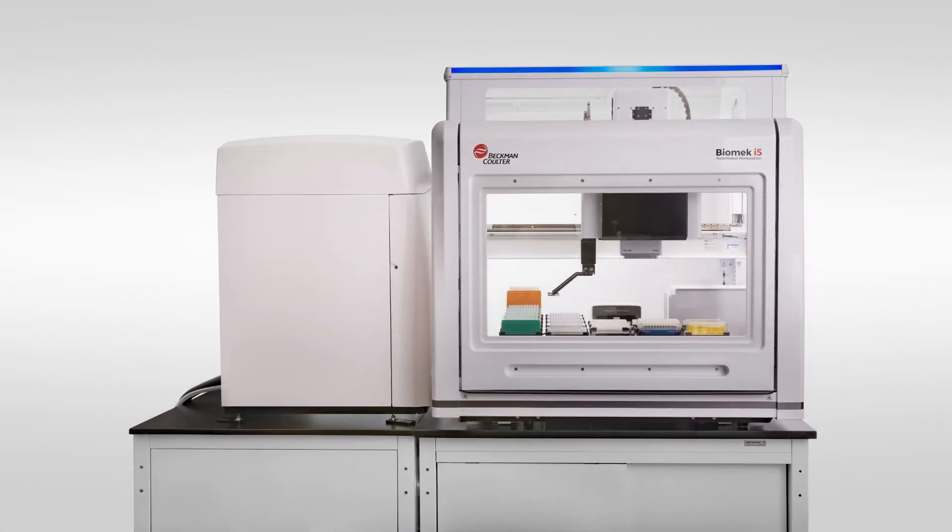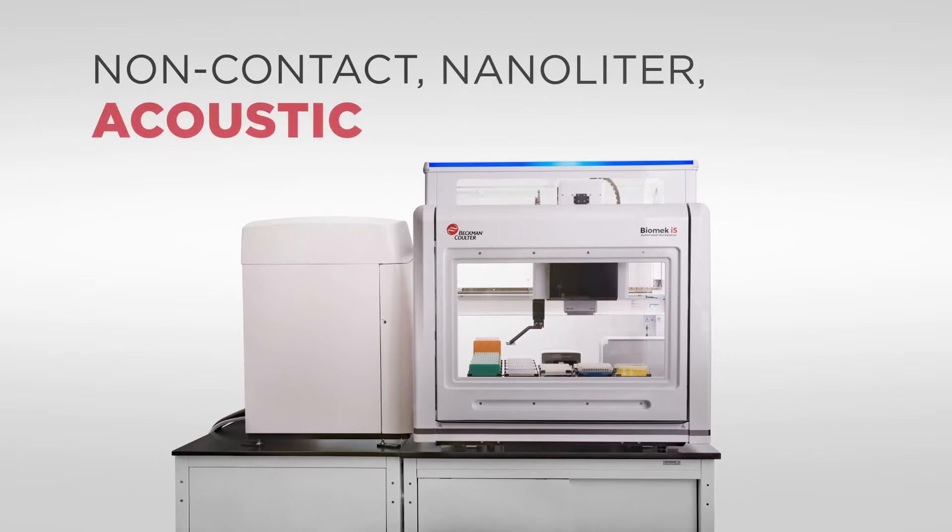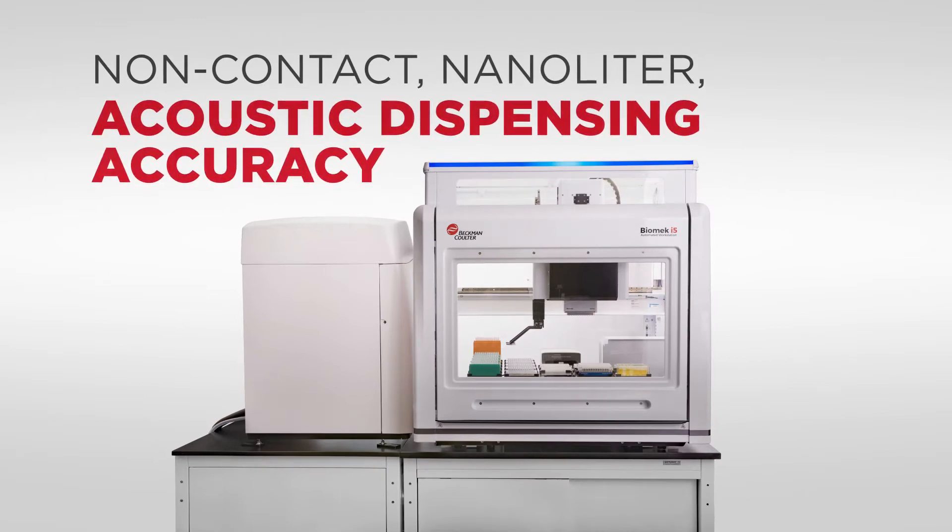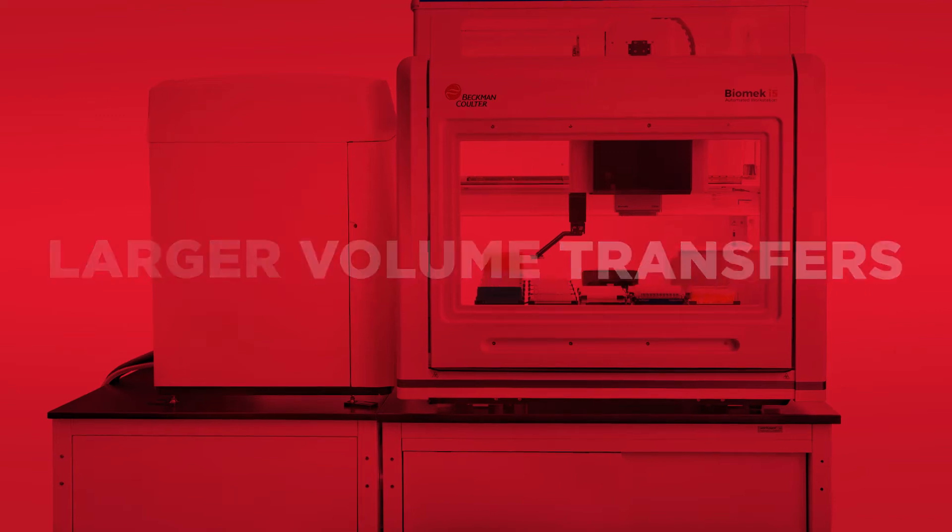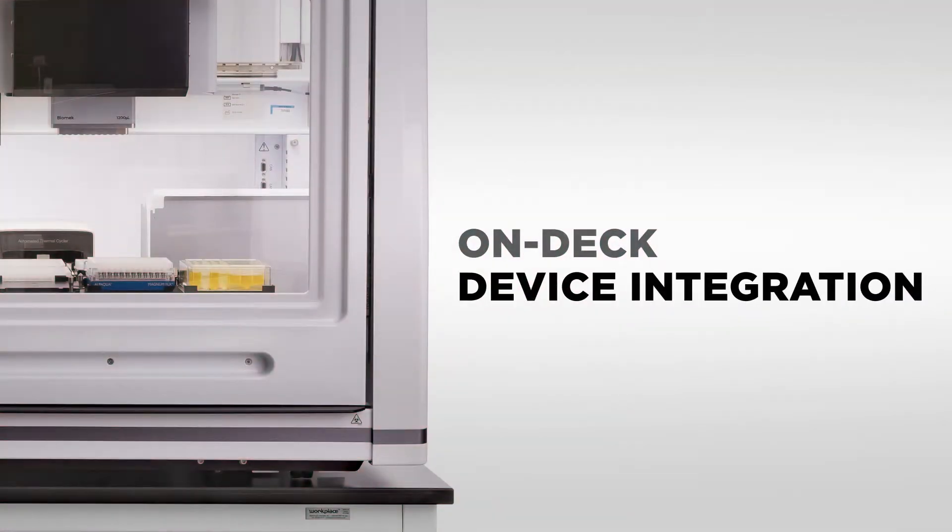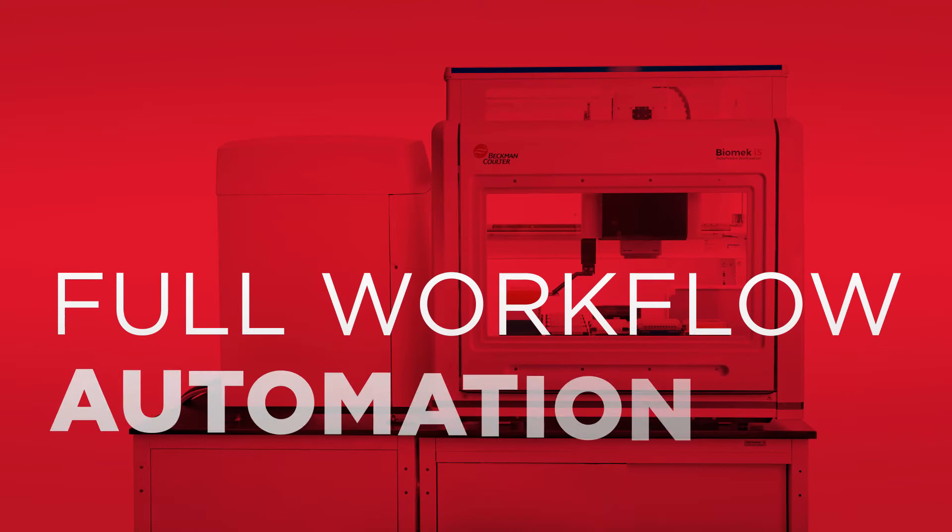The new Beckman Coulter Echo and Biomech integration allows you to leverage the non-contact nanoliter acoustic dispensing accuracy of the Echo with the larger volume transfers, optional HEPA filtration, and on-deck device integration of the Biomech for full workflow automation.